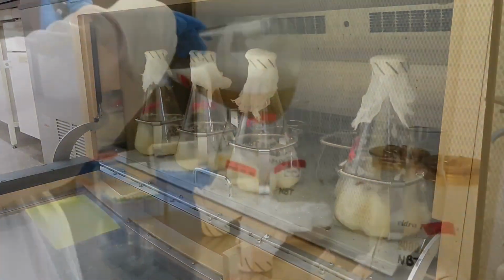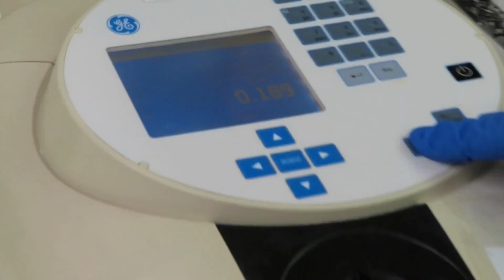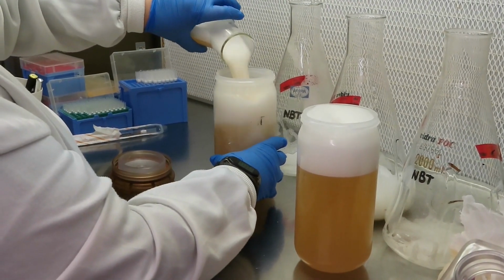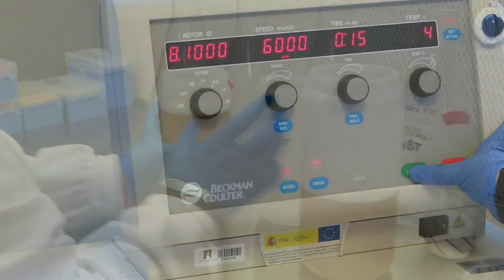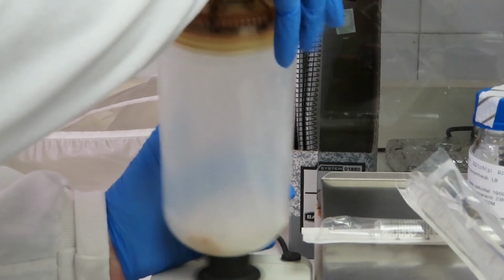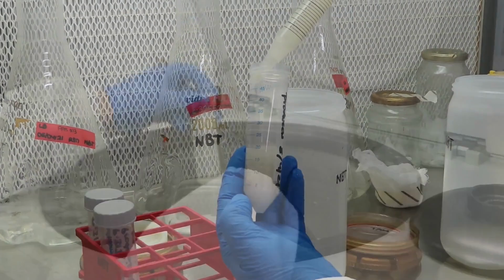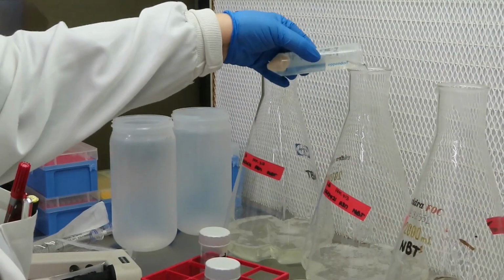The next day, the optical density of the culture is measured in order to check the correct growth of the cells. The culture is centrifuged 15 minutes at 6,000 g to pellet the cells. The supernatant in this case is discarded since the recombinant protein produced is contained inside the cells. The pellet is then resuspended in PBS to be washed and centrifuged again in small tubes. The obtained pellets are frozen at -80 Celsius degrees until the purification day.